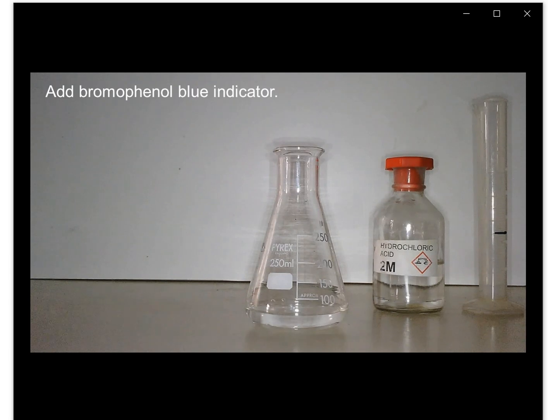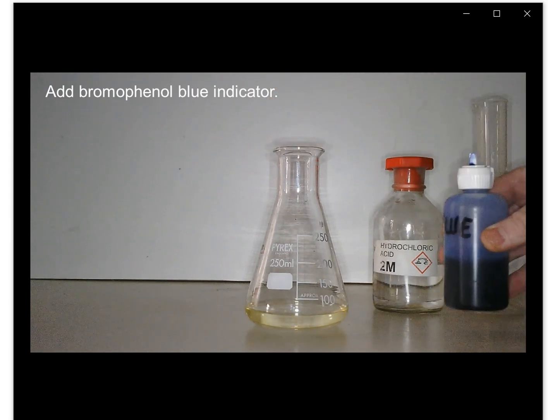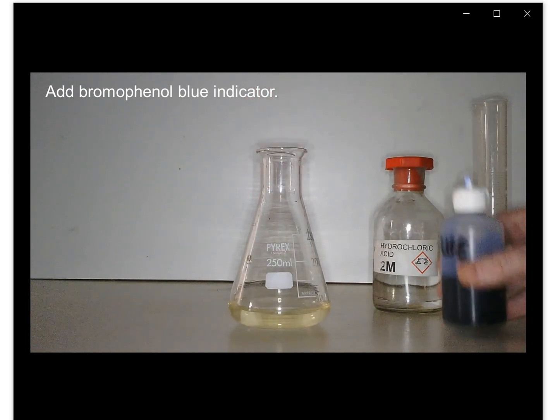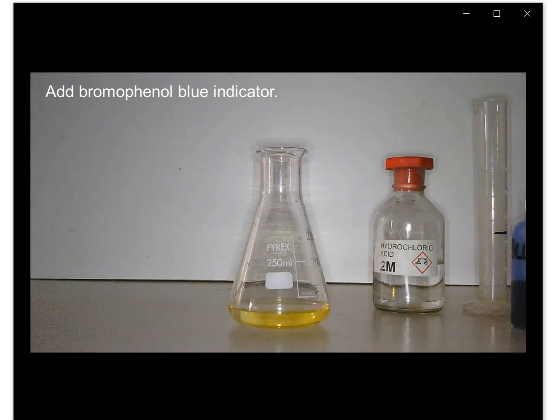Place that in our conical flask so we can safely swirl when we're adding stuff, and add some bromophenol blue indicator, which has gone yellow. And add a bit more because we want a nice strong colour so we can see changes easily.